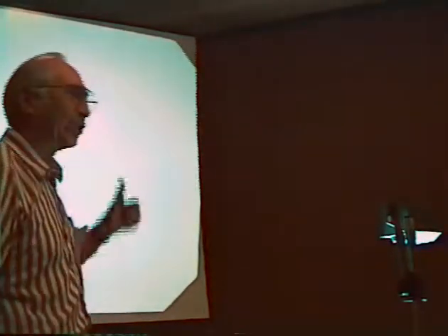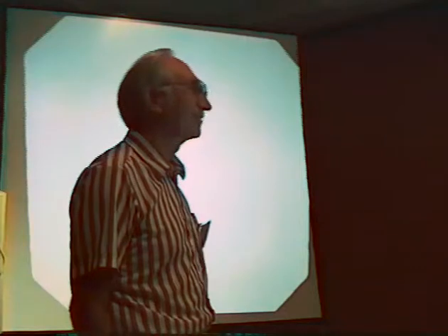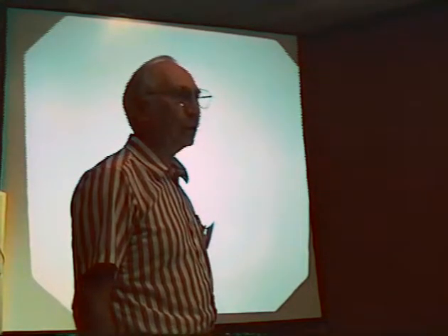And what I'm going to do is discuss a situation where we adsorb one kind of simple molecule, CO, on a metal surface, and look at a multiplicity of bands which all come from the CO stretching vibration. And what I'm going to do is try to give you some physical insight into the source of those bands. That is, I'm going to try to give you our physical interpretation rather than the evidence for it.